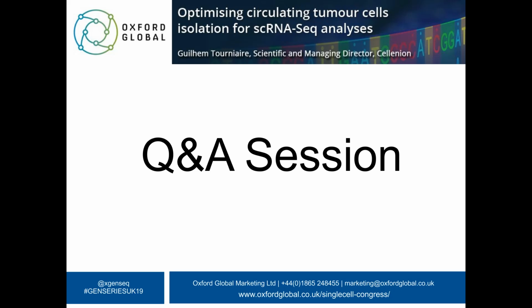Okay, and what is the size range of CTCs that can be captured? It depends on the method that you are using. In our work, we basically captured any CTCs that were larger than 10 microns.